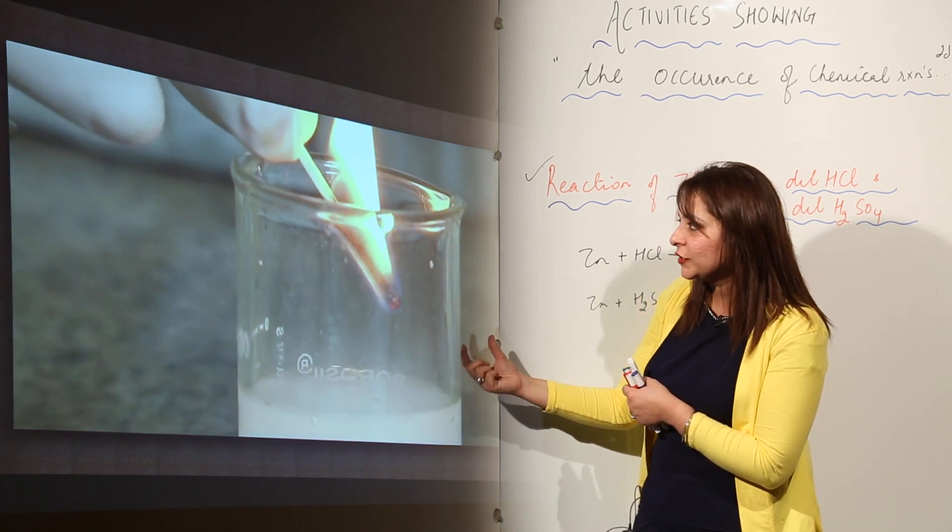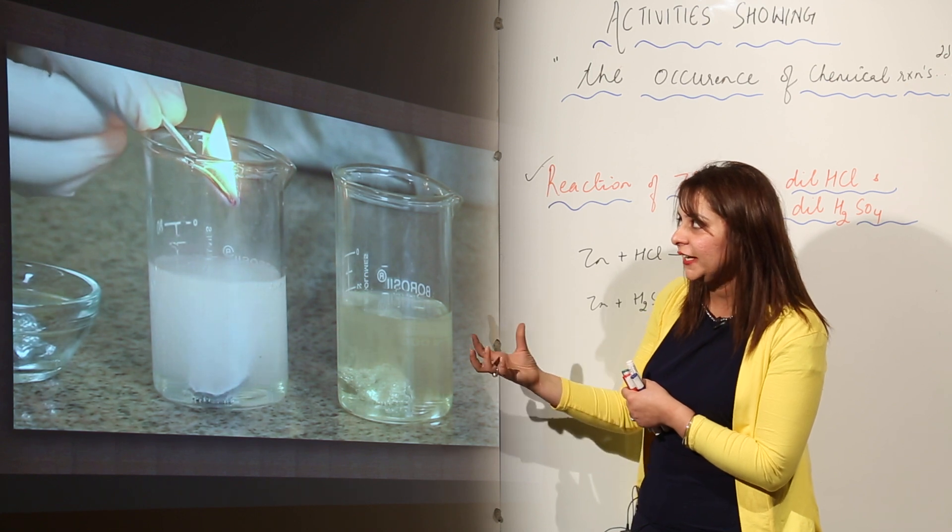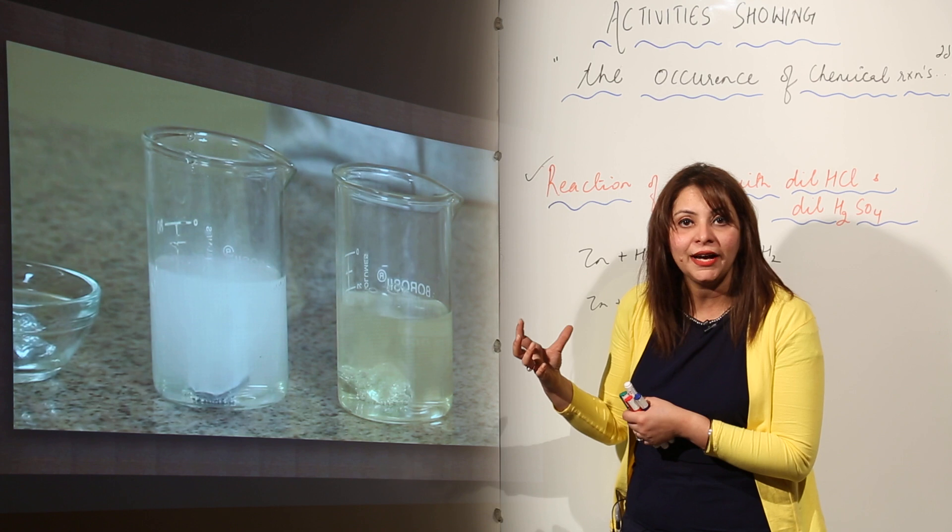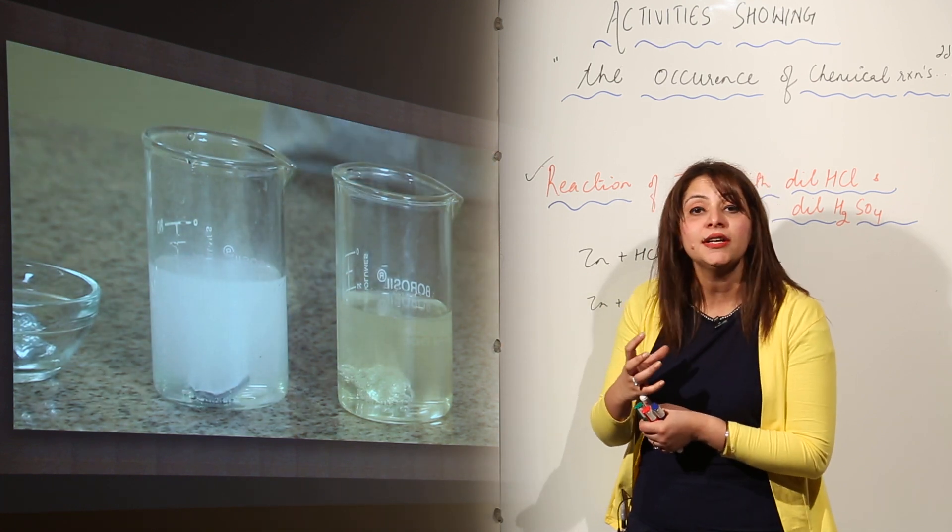What kind of change we observe when we bring the match stick in the HCl? The match stick burns with the pale blue flame, you can see. And the kind of sound it is producing is the popping sound.